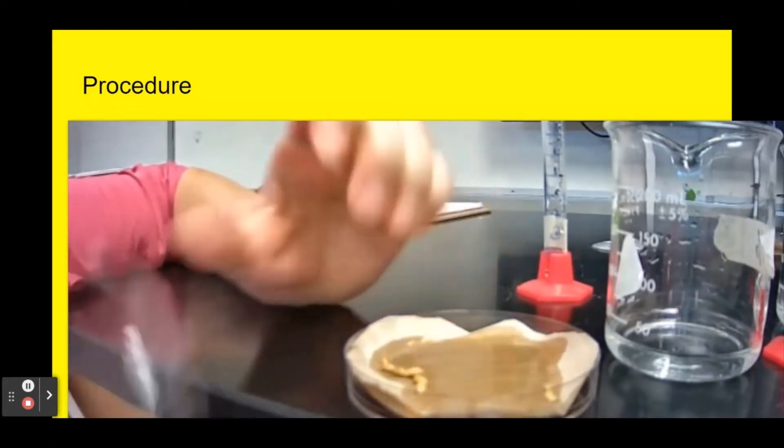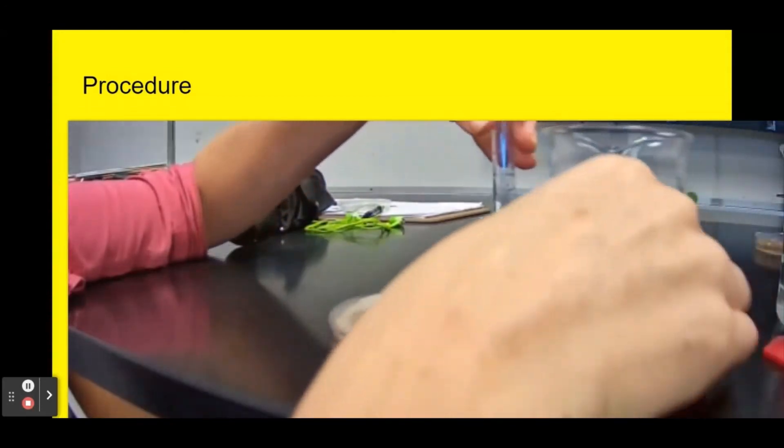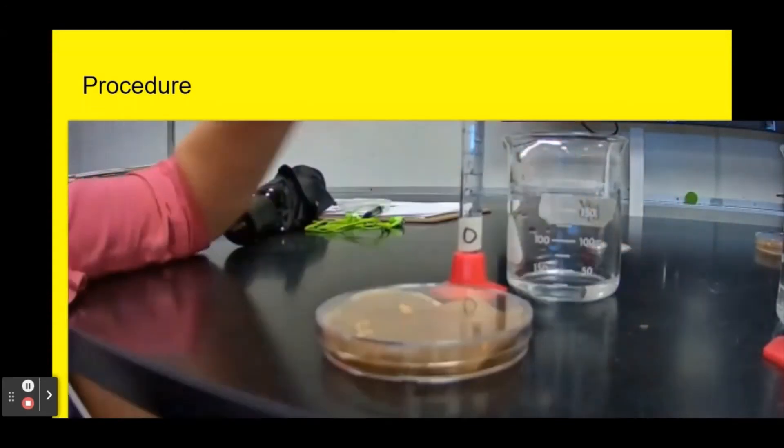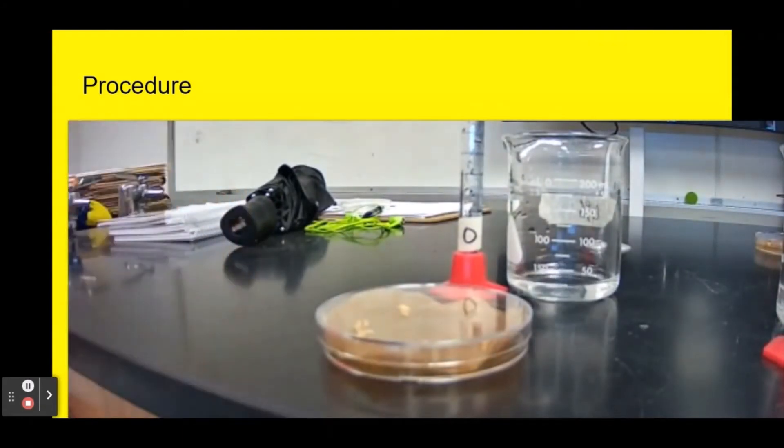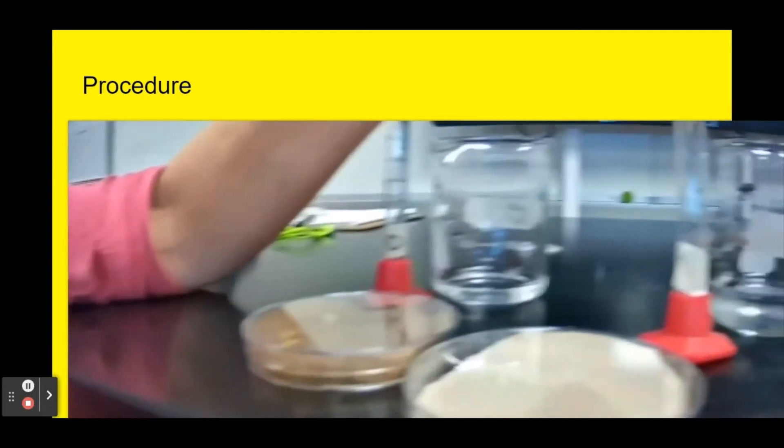I will then label my tray and put the lid on it. For right now I'm just going to set it in front of the zero percent so I can remember that was my zero percent tray.